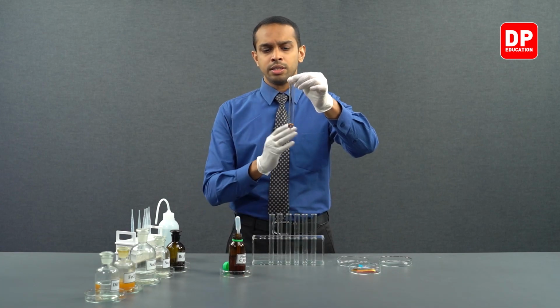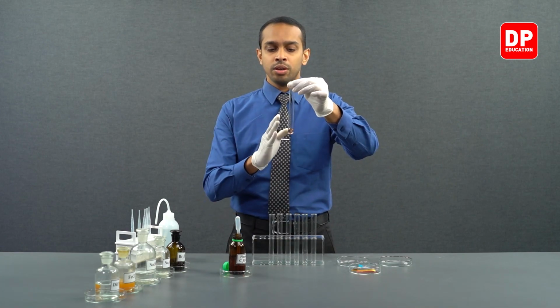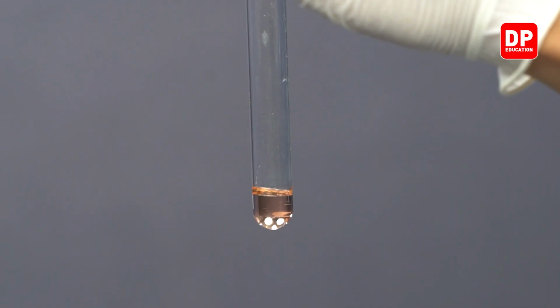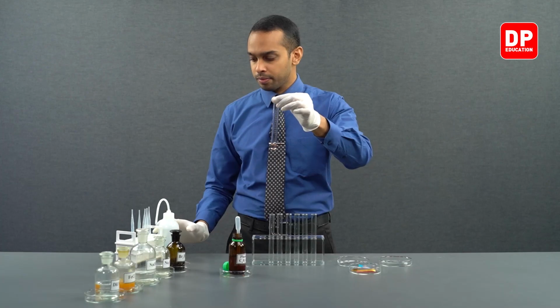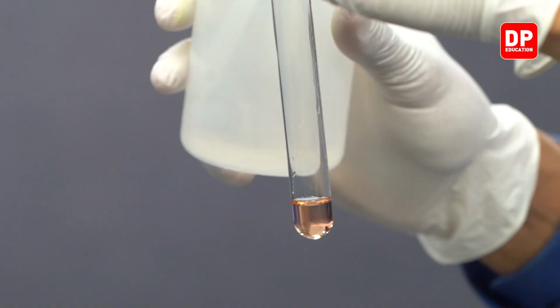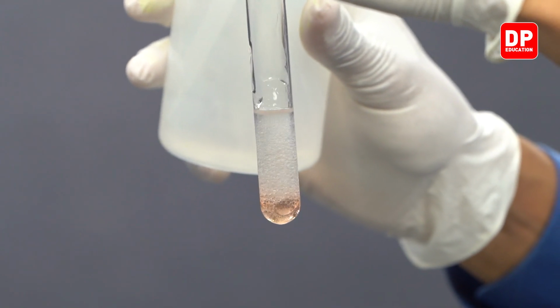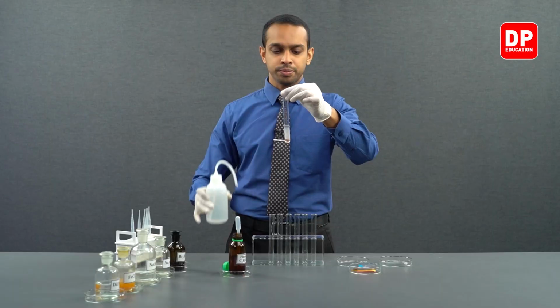Now, let's add a small amount of water to this and see whether this phenol sample dissolves in water. We will be using a wash bottle for that, and we will be adding a small amount of water very carefully.